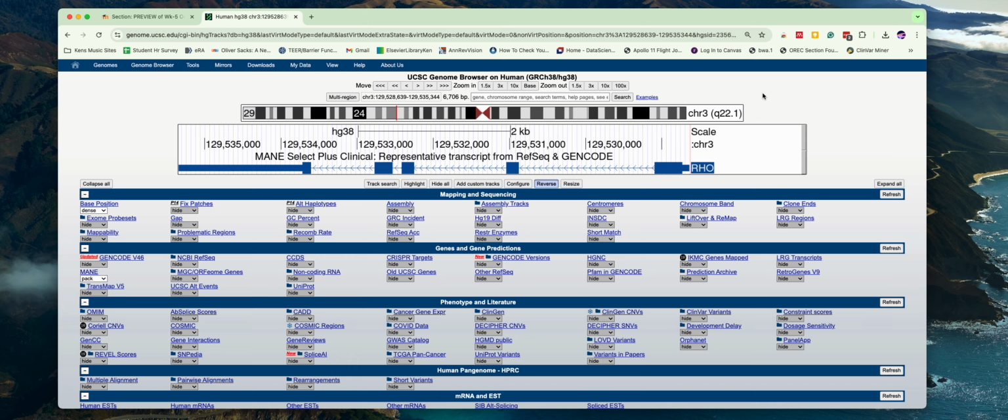This is for chromosome 3. We're in a band region, which is traditionally called from traditional staining methods. It's in the Q arm, and it's 22.1. Whether you're in the Q arm of a chromosome or the P arm of a chromosome, the Q or P values start low near the centromere, and they increase as you go out to the ends of the arm. So here on the chromosome, you see where you are physically on chromosome 3.